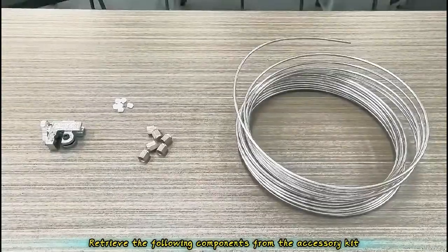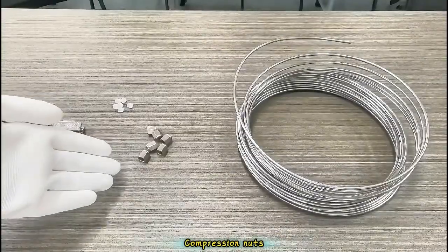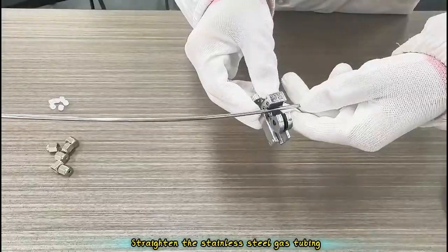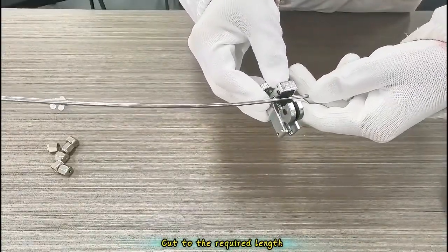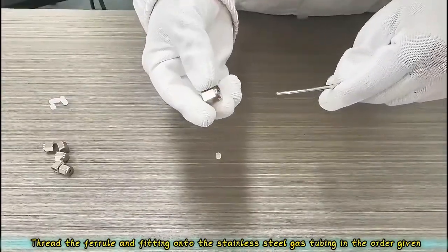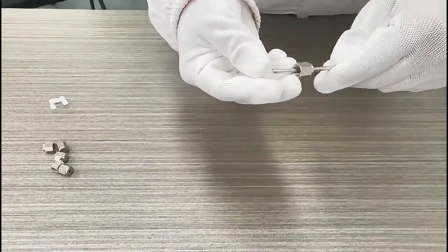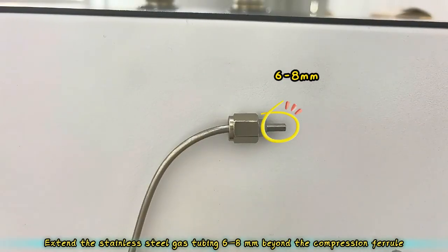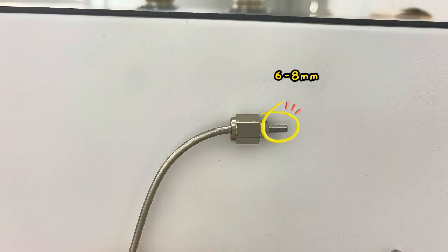Retrieve the following components from the accessory kit: stainless steel tubing, compression nuts, sealing ferrules, tube cutter. Straighten the stainless steel gas tubing. Cut to the required length. Thread the ferrule and fitting onto the stainless steel gas tubing in the order given. Extend the stainless steel gas tubing 6 to 8 mm beyond the compression ferrule.